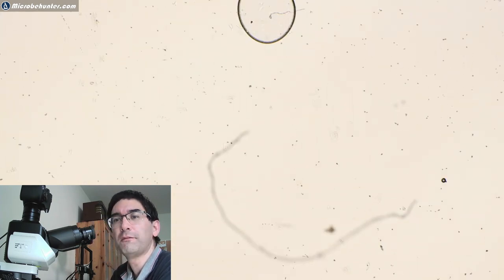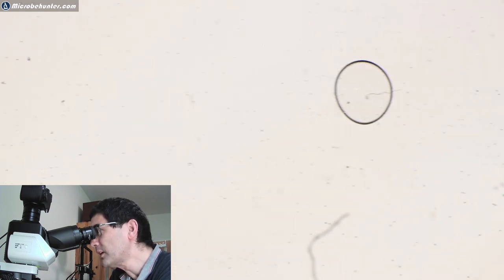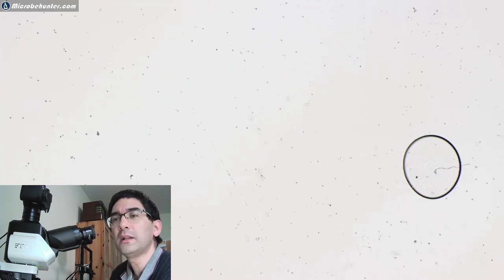You know, this seems to be a fiber from the Q-tips. I can already see the cells, but very, very lightly and brightly. So what I'll be doing is, there's lots of other dirt on here as well, so I'm just gonna go here in the center. You might not be able to see this very well, so I'm going to go up with the magnification here. That's a 10 times objective. Let's see if you're able to see a little bit more. It's overexposed. It is out of focus. I don't even know into which direction I have to turn this. Here we go.